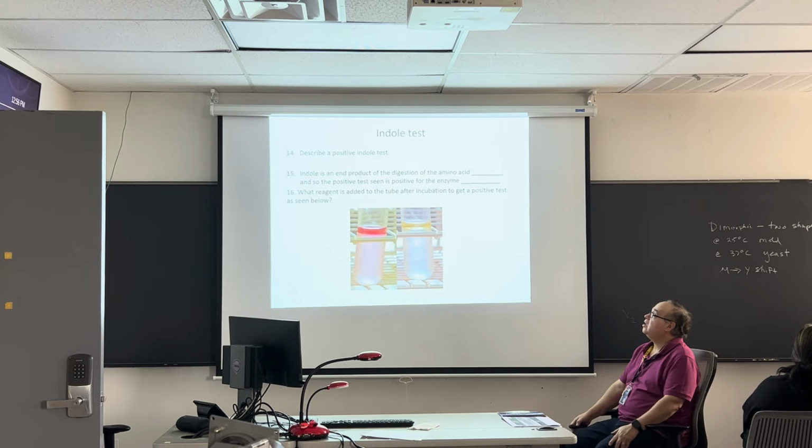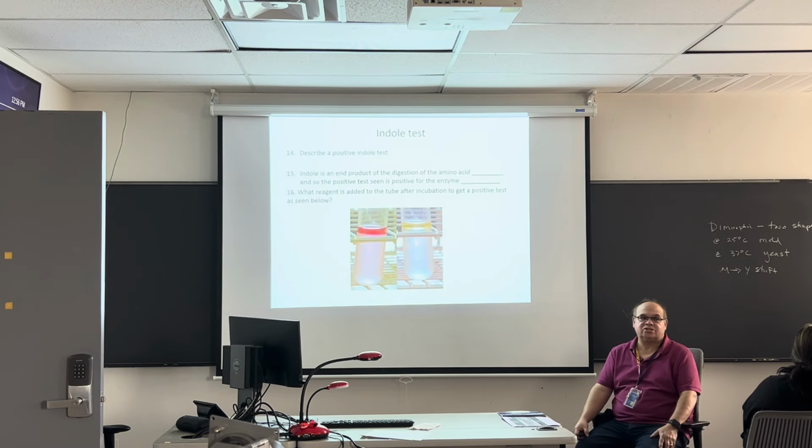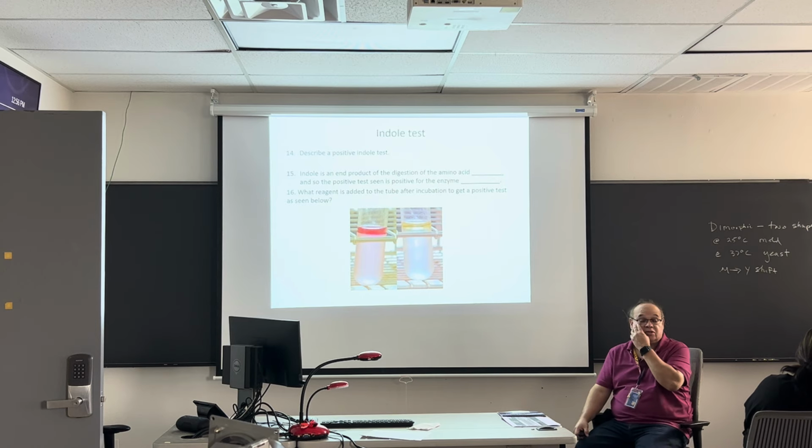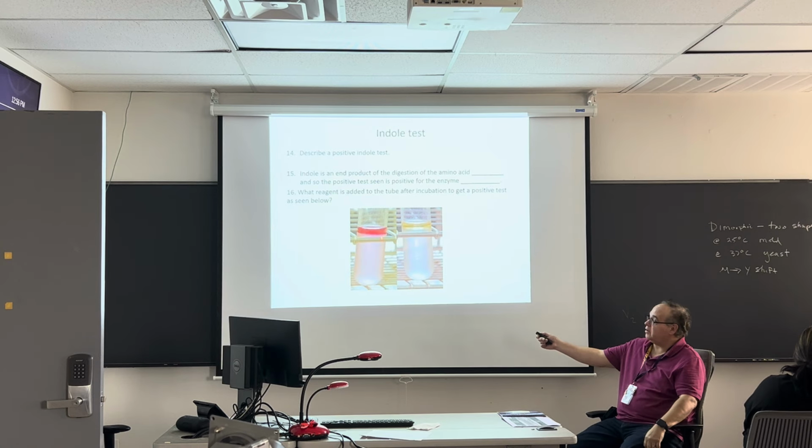Okay. This is the indole test by itself. Okay? So describe a positive indole test. A red. The bright red. It's got a red layer. Yep.